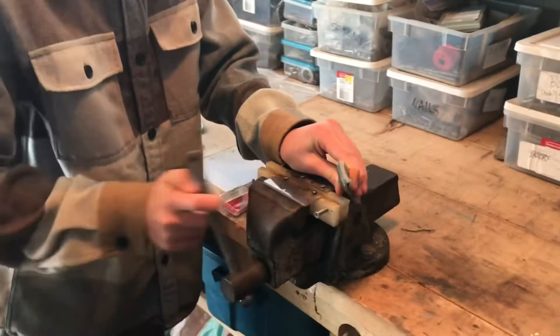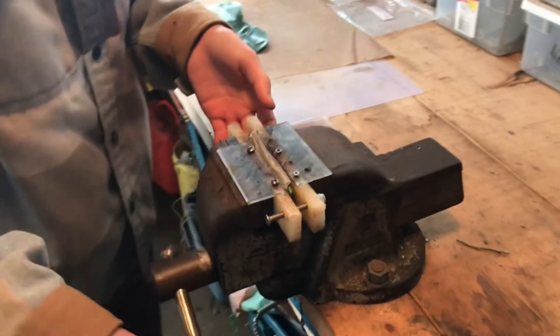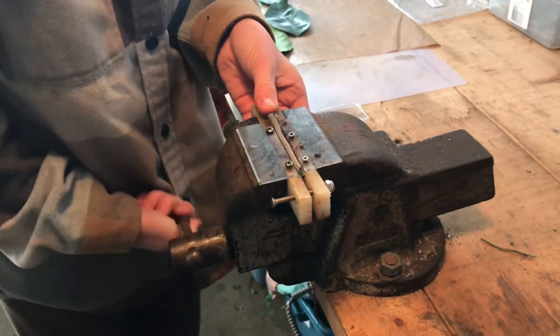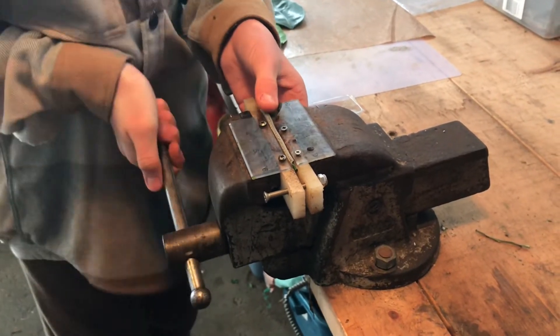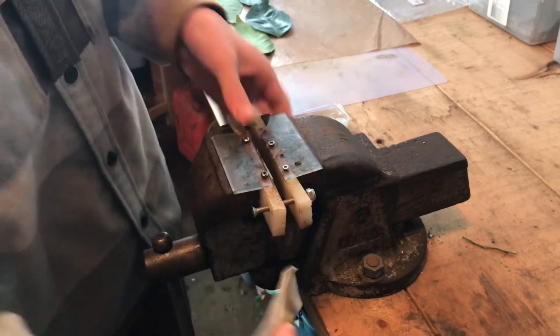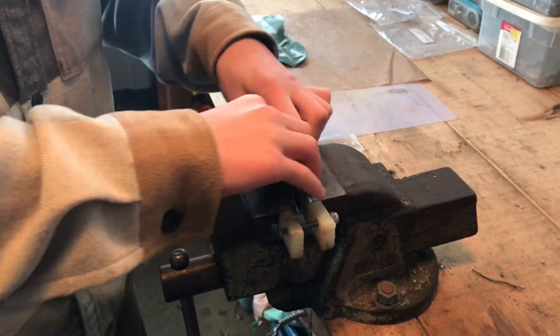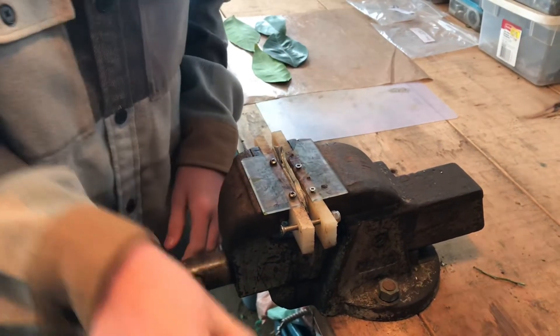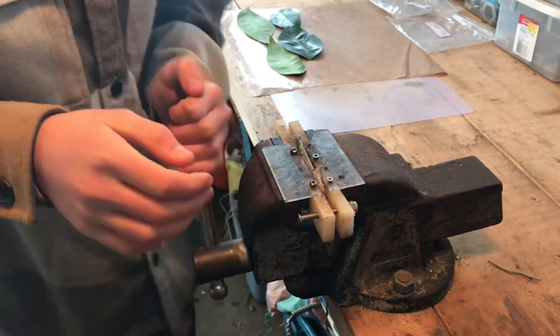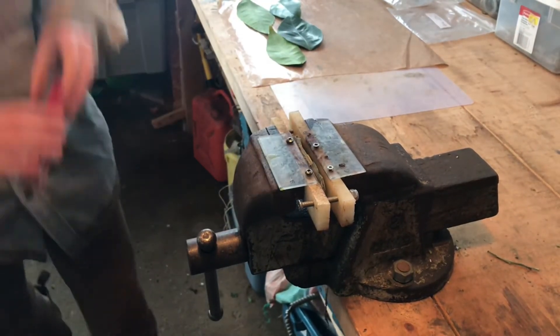And then you go to the bench press and you pop them in just like that, and you're just going to want to give it a little bit of a squeeze to make it a little bit flat, and then you get them out again. Sometimes if they're really thick you might want to fold it over again. Then you just push it down a little bit and you don't want any of the mesh over top.